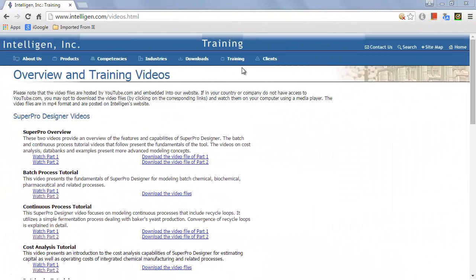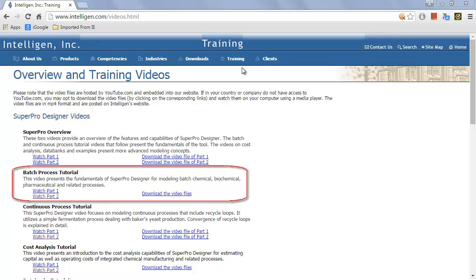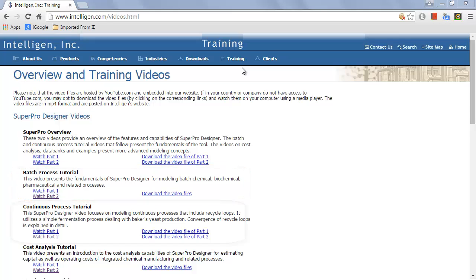Before viewing these videos, it is recommended that you first watch the batch process tutorial videos as well as the continuous process tutorial videos under the training page of our website, since many of the fundamental modeling concepts for SuperPro are discussed there. These fundamentals will not be repeated in the biofuel example videos.